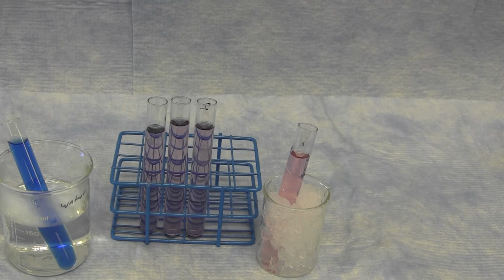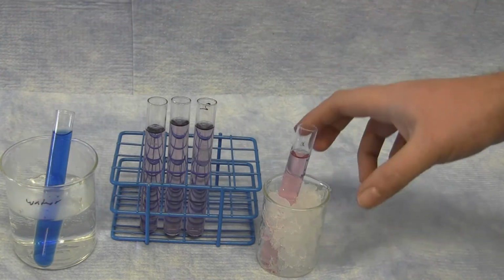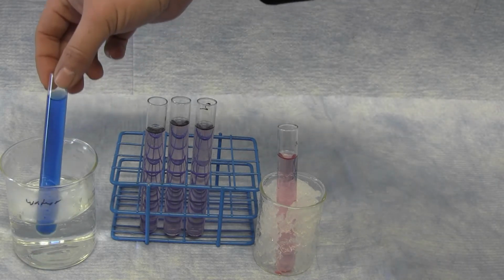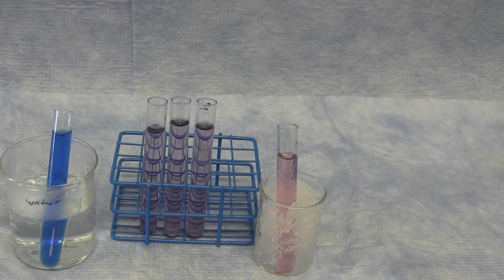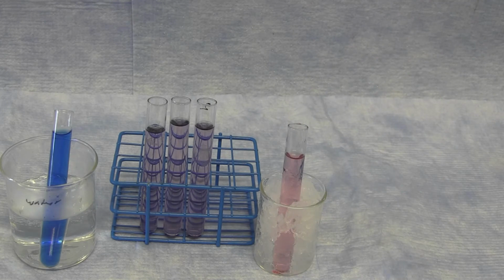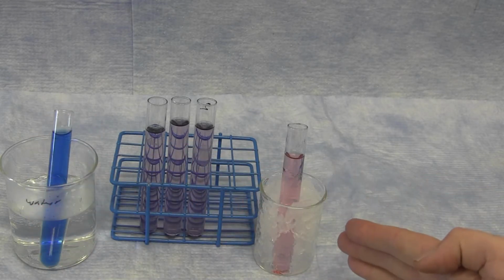You will then be obtaining the absorbance using a spectrophotometer of all 3 of these solutions of cobalt chloride at these 3 different temperatures. You will be obtaining the absorbance at 2 different wavelengths. One wavelength looks at the absorbance specifically of the cobalt tetrachloride complex. The other wavelength looks specifically at the absorbance of the cobalt hexaaqua or water complex. Using the absorbance, you can then convert these to concentration at equilibrium of both of these complexes in each of these 3 different temperatures.